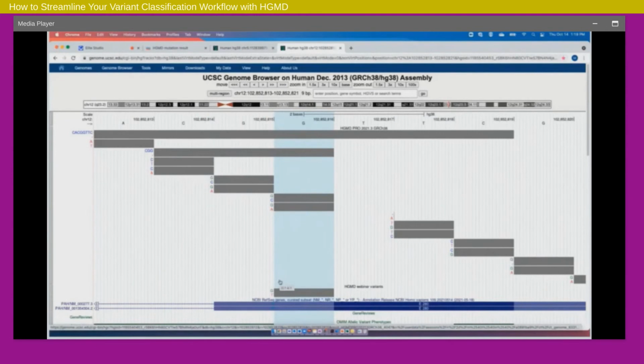And so this is something that as part of ACMG, you can use as a piece of evidence if these are then shown to be pathogenic. That tells you that this codon has some sort of functional importance. And so having this kind of neighborhood view to see what's upstream or downstream can be very helpful at times. And so, now that we've talked about some of the applications for using a downloadable VCF, I'd like to move on to some other use cases.